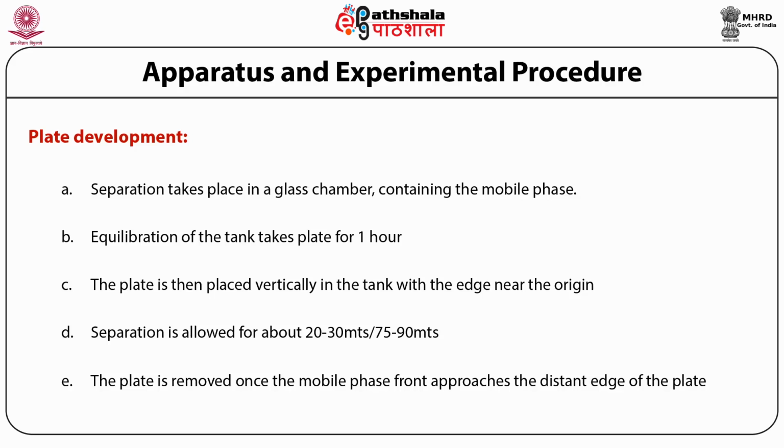The separation is allowed for about 20 to 30 minutes for analytical procedures and for about 75 to 90 minutes for preparative procedures. Once the solvent has reached the other end, the plate is removed, and then there are different methods by which the spots on the plate can be detected.